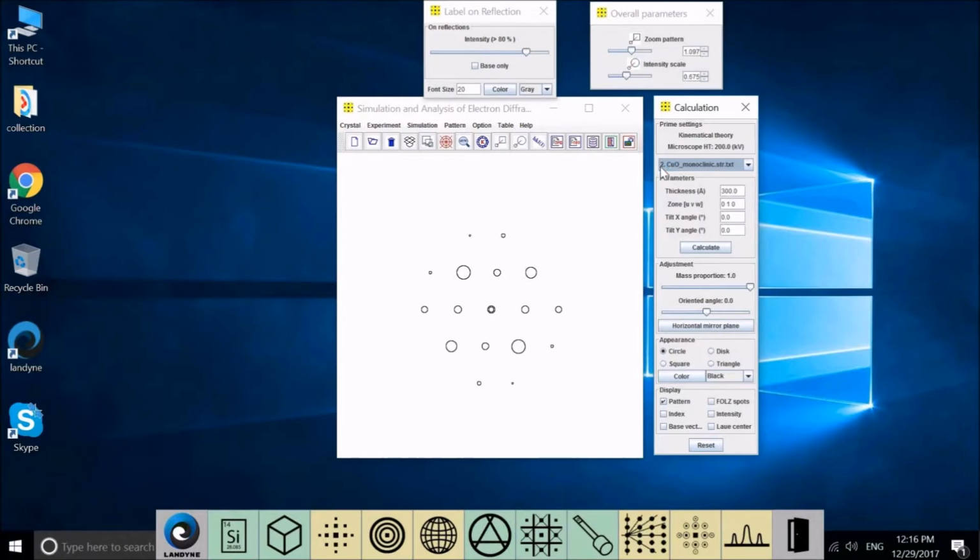And you can see this is the twin in this diffraction pattern, and this one was shared, and this is the twin spot, and this is a twin spot. And you can see how the twin is formed by selecting one as a disk.